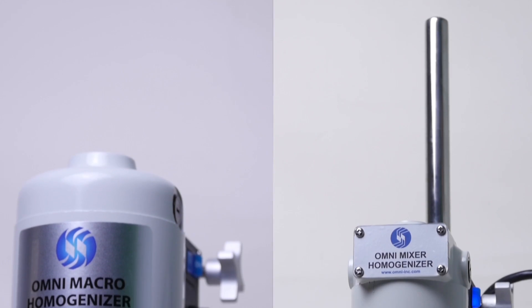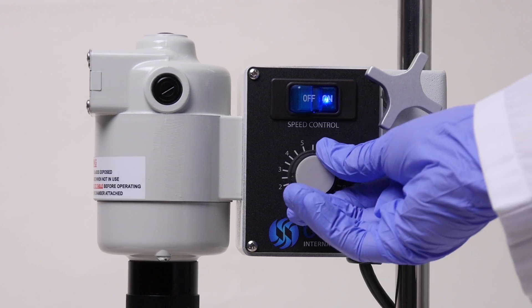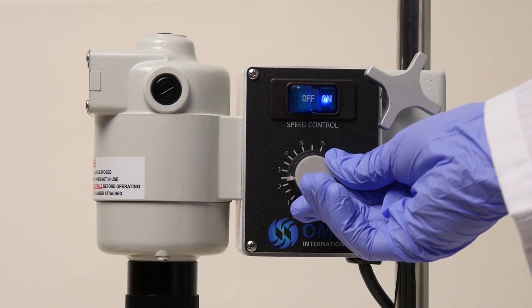High quality motors from 600W to 1800W with variable speed control from 500 to 20,000 RPM.